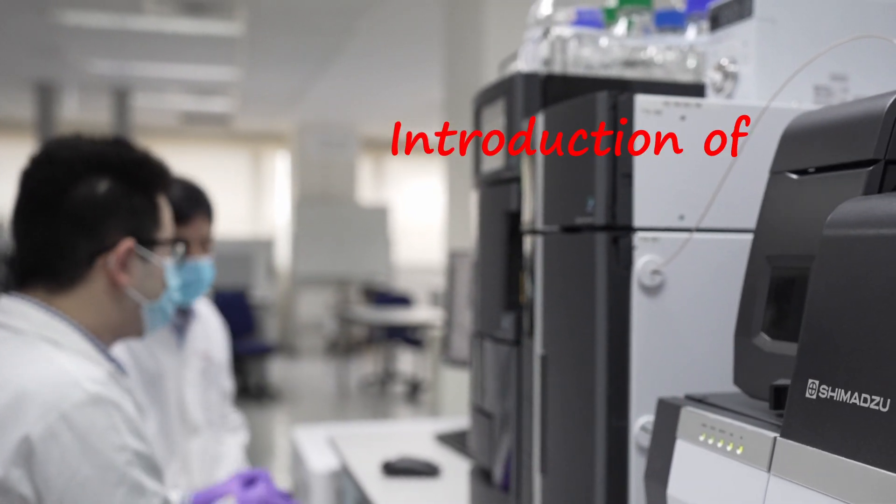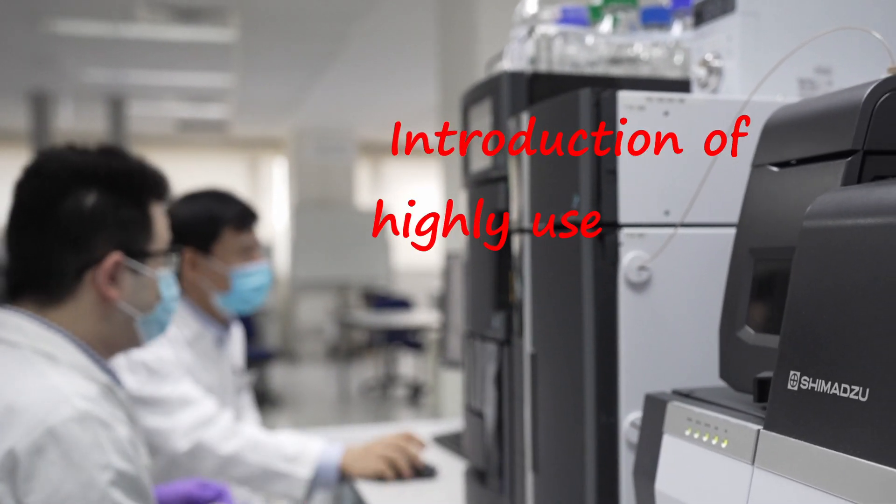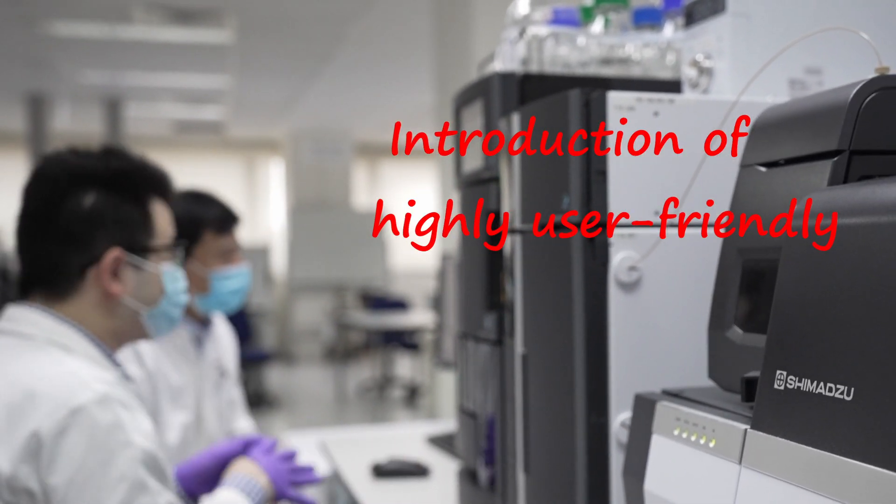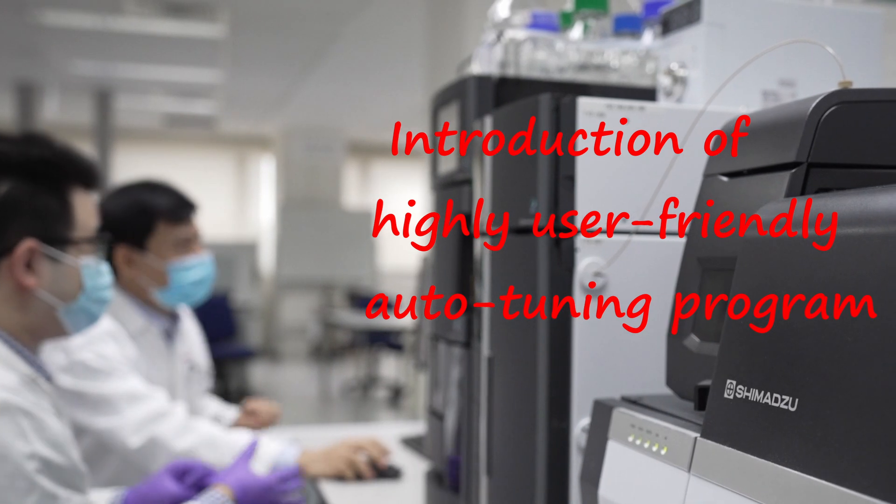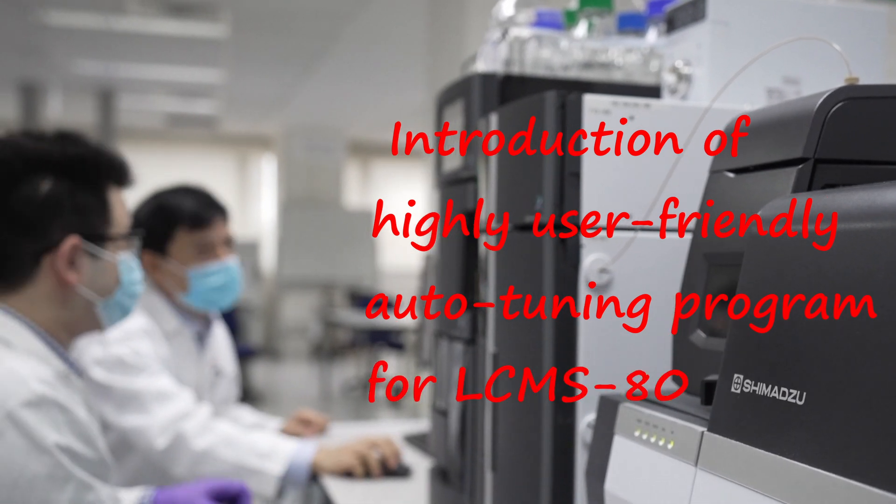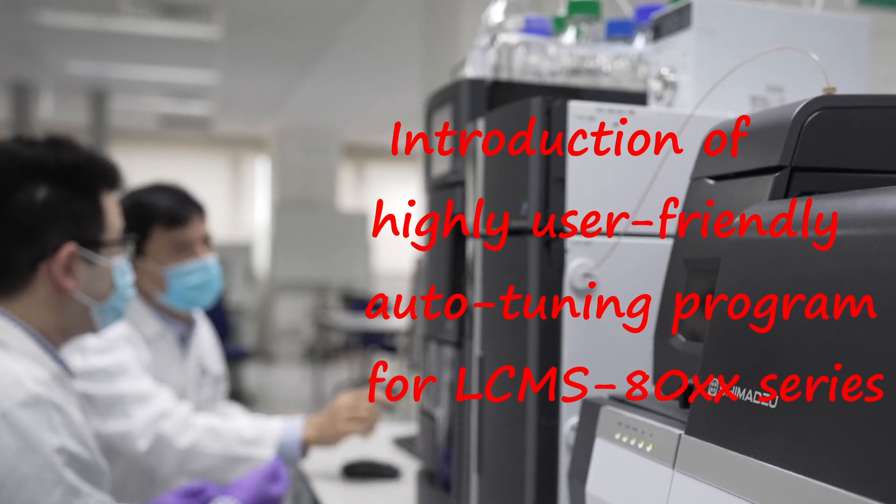Hello everybody, in this video we will be demonstrating how to perform auto-tuning for Shimadzu LC-MS triple quadrupole system.